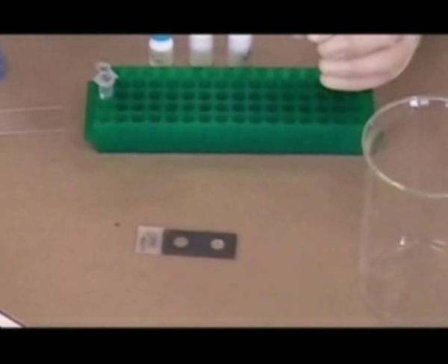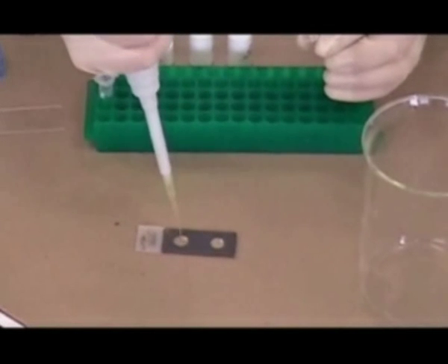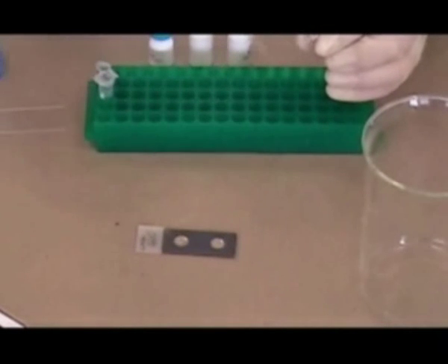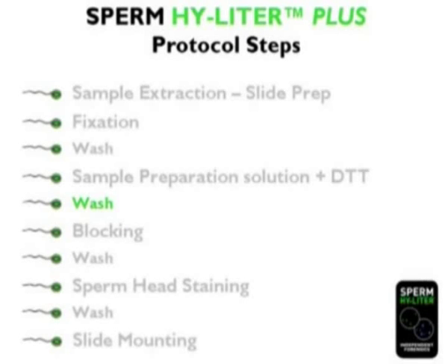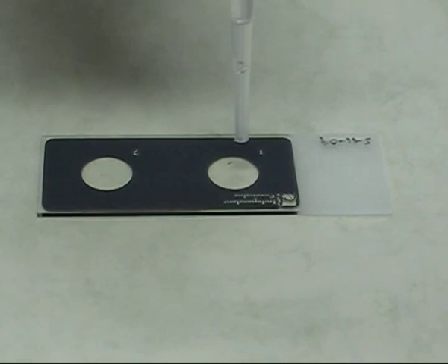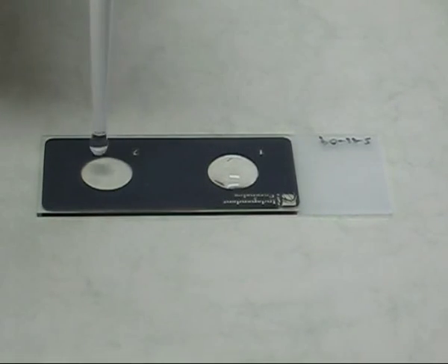After the fixative is washed off, user-prepared sample preparation solution plus DTT is pipetted onto the sample window and the slide is incubated at room temperature for 30 minutes. This step conditions the sample for staining. After the sample preparation step is complete, the slide is once again rinsed with diluted Sperm Highlighter wash solution.